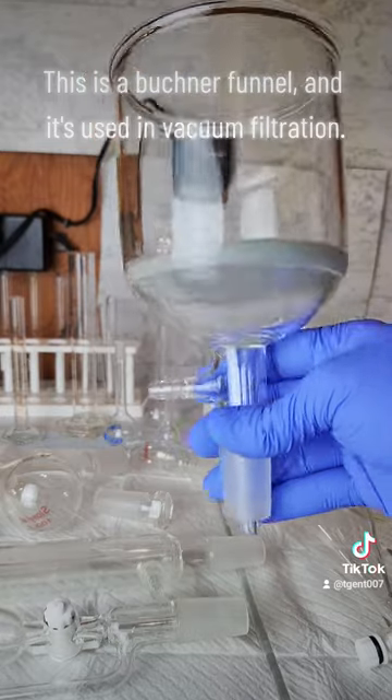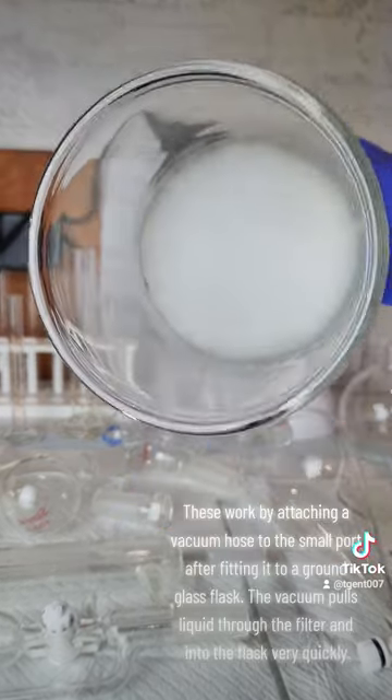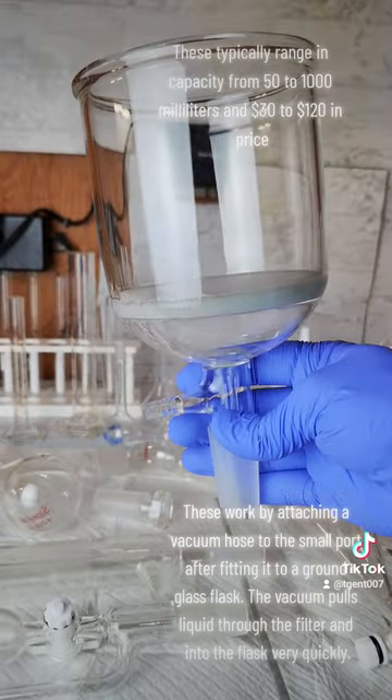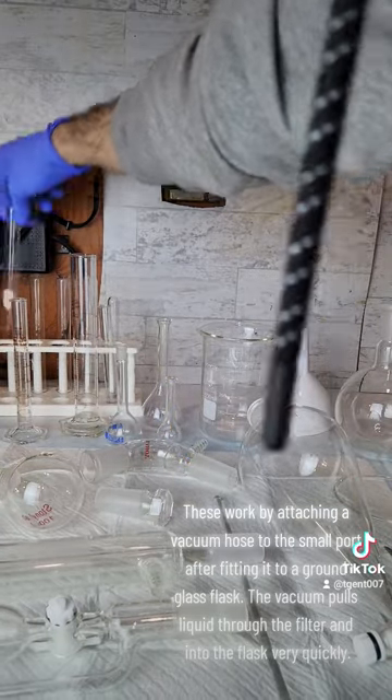This is a Buchner funnel and it's used in vacuum filtration. These work by attaching a vacuum hose to the small port after fitting it to a ground glass flask. The vacuum pulls liquid through the filter and into the flask very quickly.